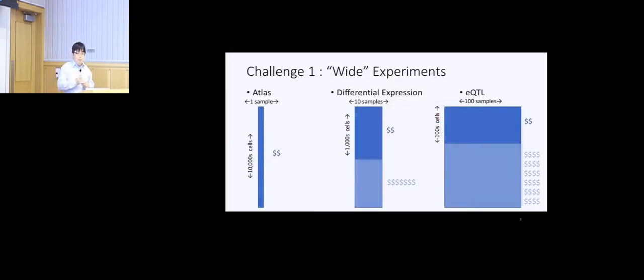So when we are doing the single cell analysis with this kind of platform, this is a really good platform to create some atlas of a single individual, single sample. And if you wanted to deeply analyze what cell types are there, and what are the profiles of each of the cell types, this is a very good platform.